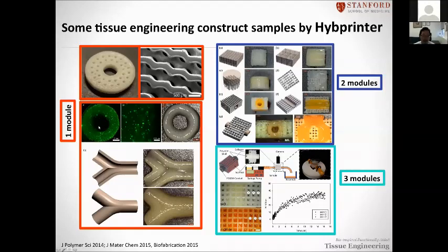Here it is with stereolithography. The green color indicates cells, which show green fluorescence emission. So you can make different shapes, like a larger vessel with a bifurcating structure. And you can also combine the two modulars, FDM and stereolithography.